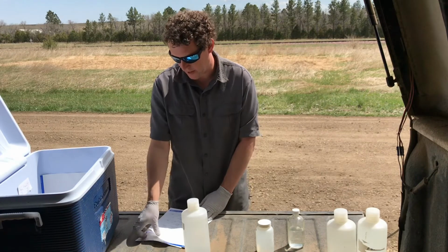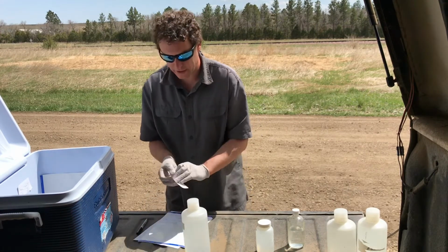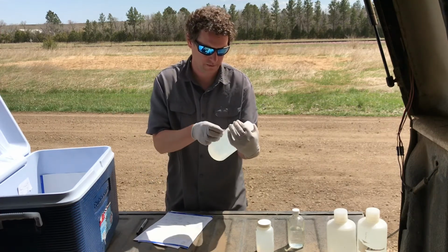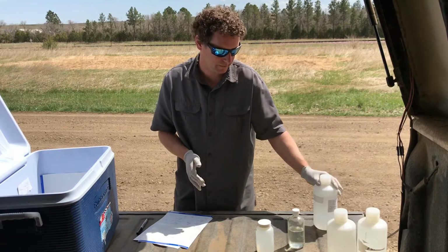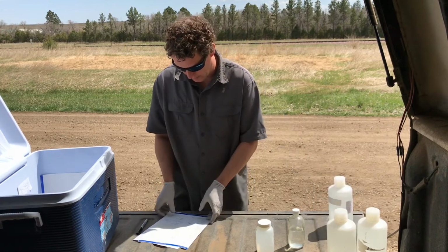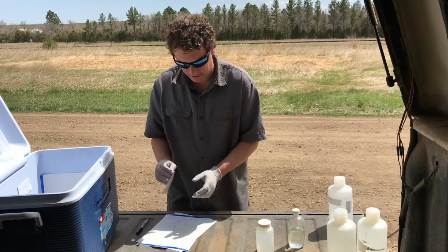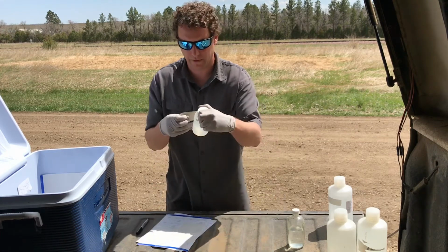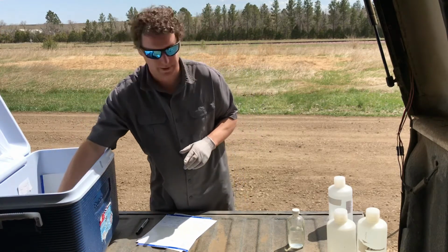I'm going to take the B bottle label here. That goes on our other 1-liter Nalgene. Tape it on there. We're going to set that aside to preserve with sulfuric acid. And now our C bottle label goes on our 250 milliliter bacteria bottle, a little one. And this sample is also done. This goes in our cooler under loose ice.